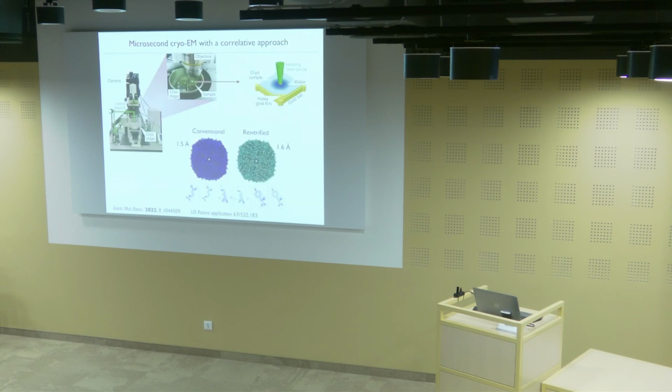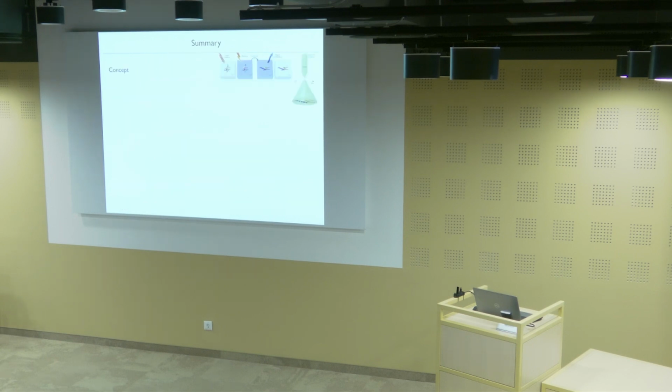Okay, I'm going to skip this slide and just sum this up for you. So I walked you through the concept of doing microsecond time-resolved cryo-EM experiments. We get a time resolution of 5 microseconds or better. We think we should be able to go down to something like maybe 10 nanoseconds. We can get near atomic spatial resolution for suitable samples. There seems to be a neat trick to get rid of preferred orientation, a problem that makes a lot of cryo-EM projects still fail.